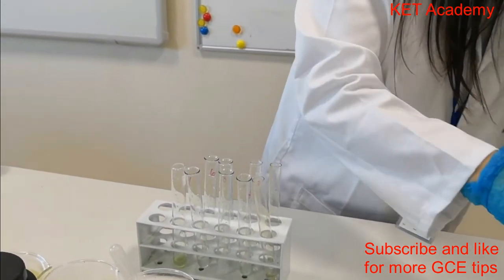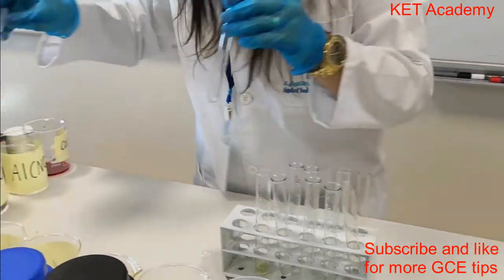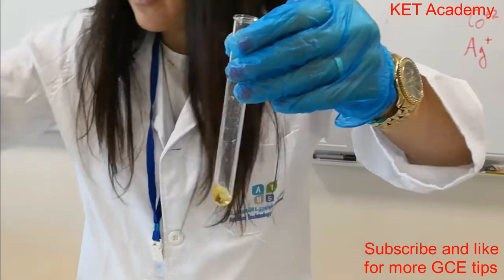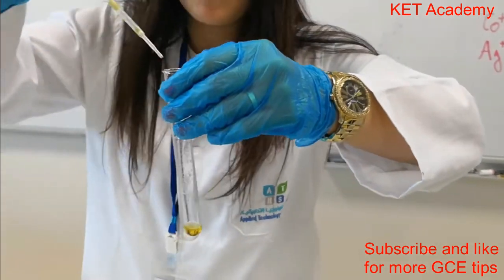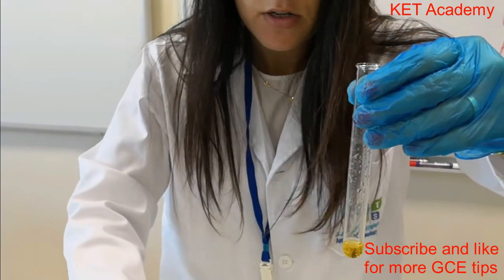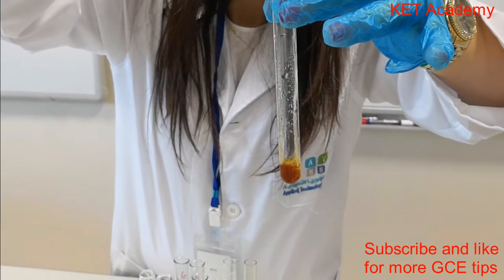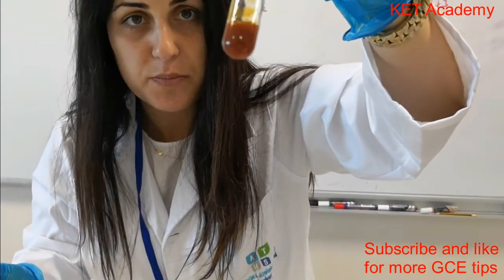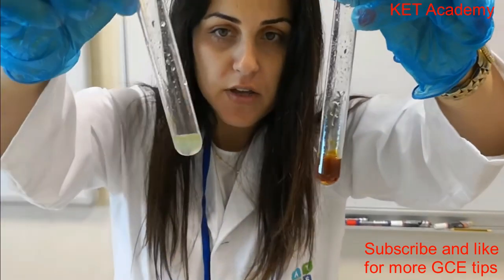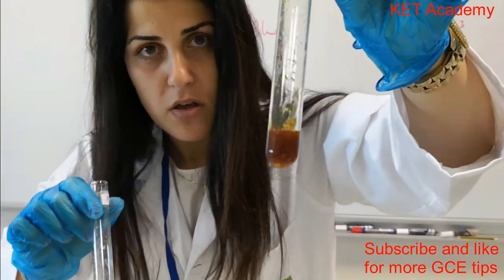Whereas the iron 3, it's a brown color. Let's see the iron 3. Now you will notice that the iron 3 already has a color, but this color changes if I put sodium hydroxide. It becomes a dark brown precipitate. So this is iron 3 and this is iron 2. Iron 2, iron 3.